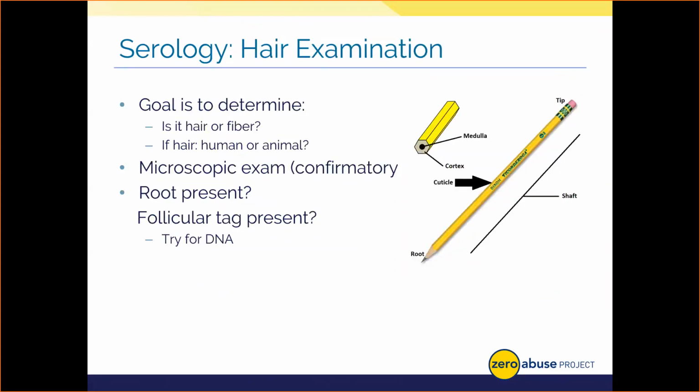It has an external hardened surface called the cuticle, an internal or kind of middle ground area that holds pigment for coloration called the cortex, and an inner shaft that may be present. I say may be present, it could be absent in humans, called the medulla. Thus, the cuticle is like the outer yellow part of the pencil, while the pigment holding cortex is the wooden middle layer, and the pencil lead itself, if it's there, is the medulla. We can use those 3 features alongside an evaluation of the root if it's present and the tip if we can see that to determine if we have a hair that's human or animal or if we have a fiber.